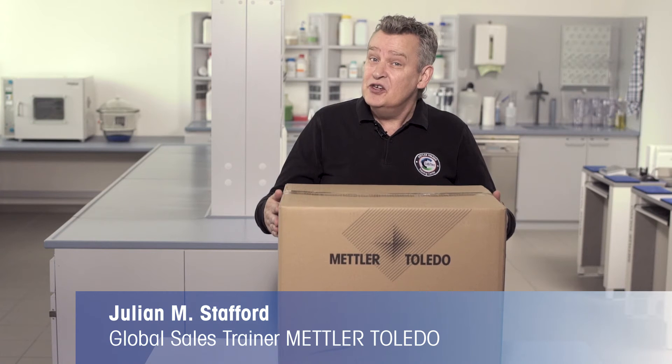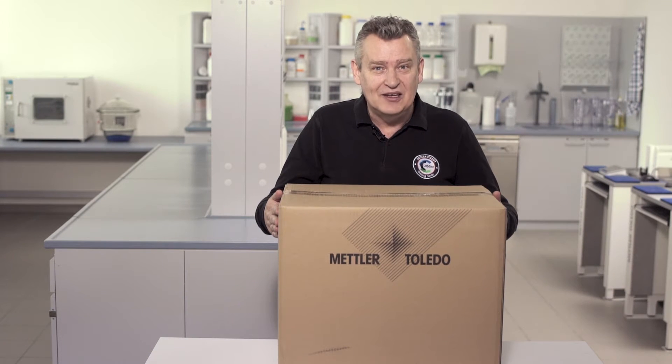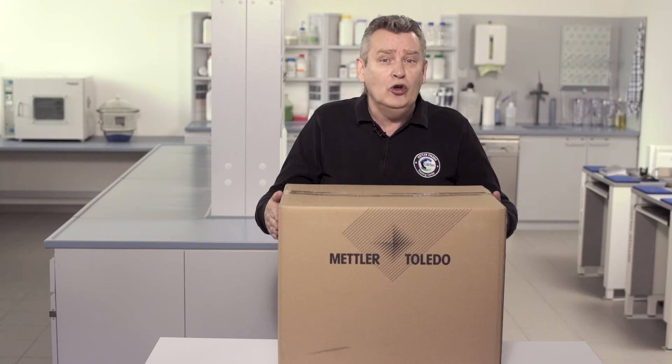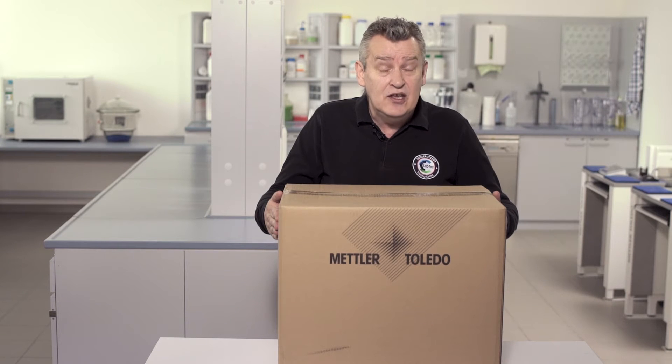Congratulations on your purchase of the HC-103 Halogen Moisture Analyzer from Mettler Toledo. To guide you through the unpacking and setting up of your instrument and to help you to perform your first measurement, we've put together this short instructional video. After watching this quick start guide, you should be ready to successfully use the HC-103 for your moisture determination applications.